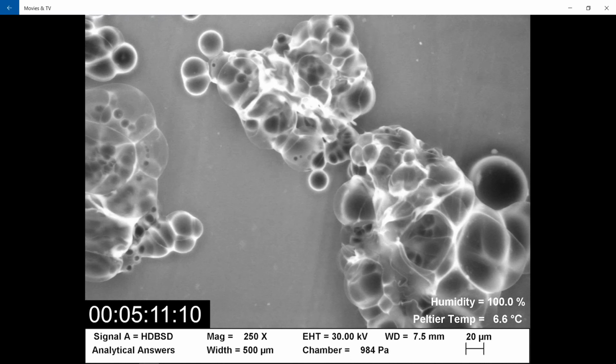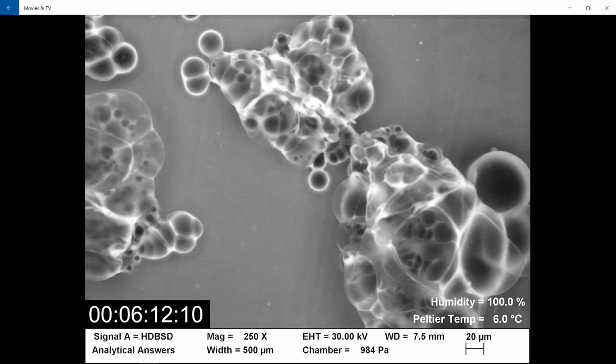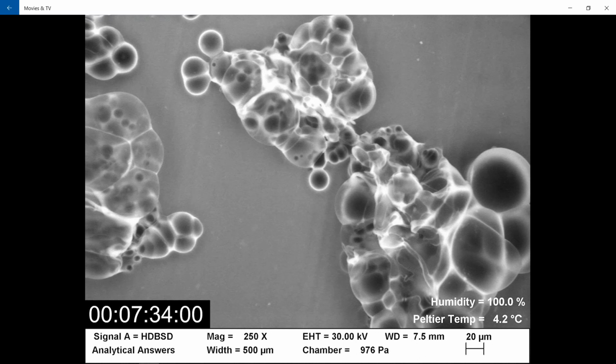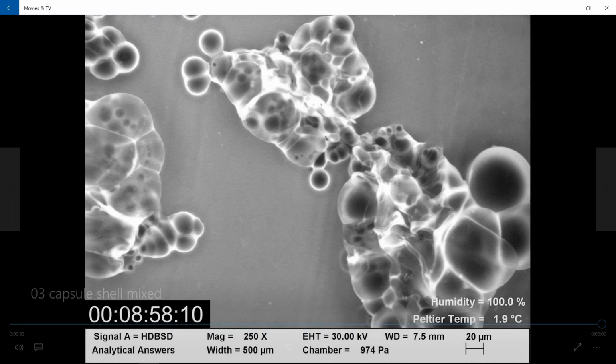This illustrates that the materials mixed very non-uniformly, because you had large domains of the fast material that was completely unblended with the slow material. So this was not a viable experiment from the goal of trying to create a homogeneous blend of those two materials to get an intermediate rate.